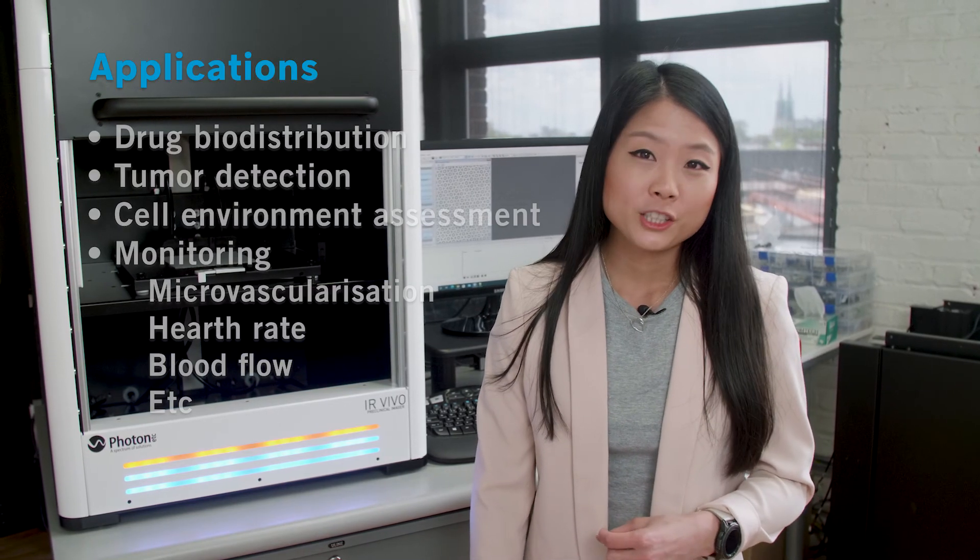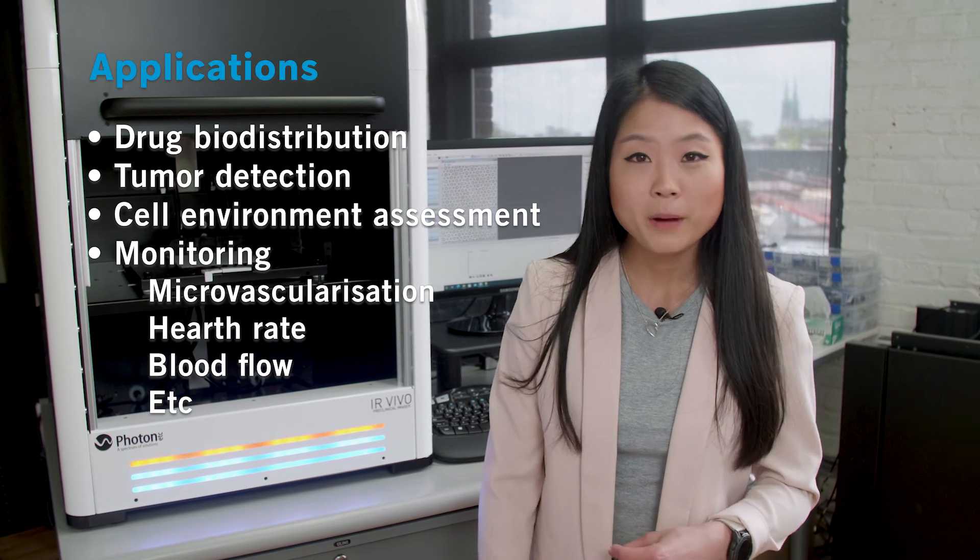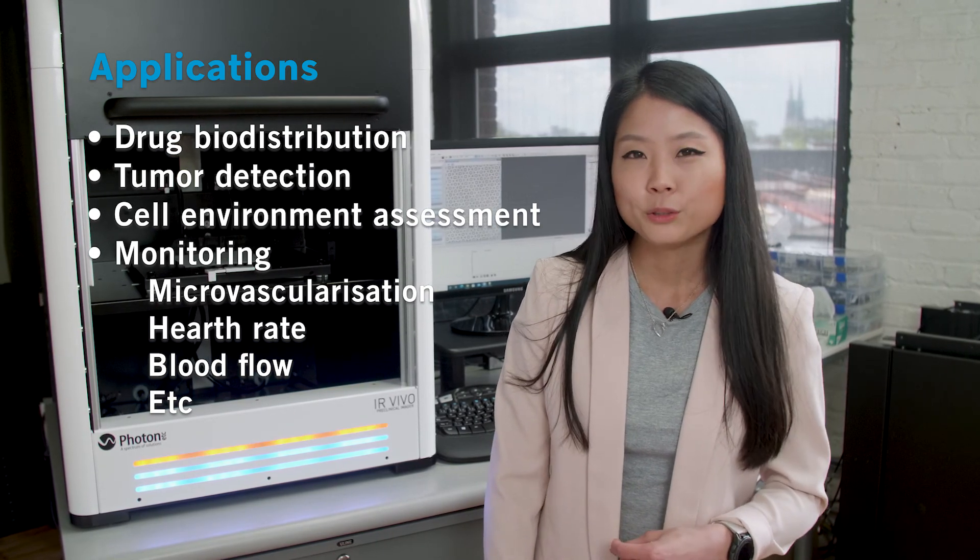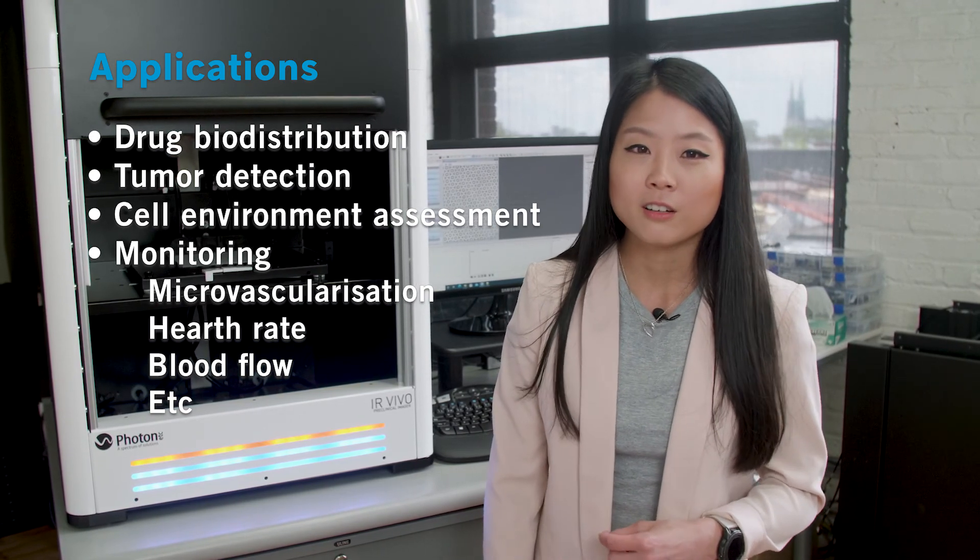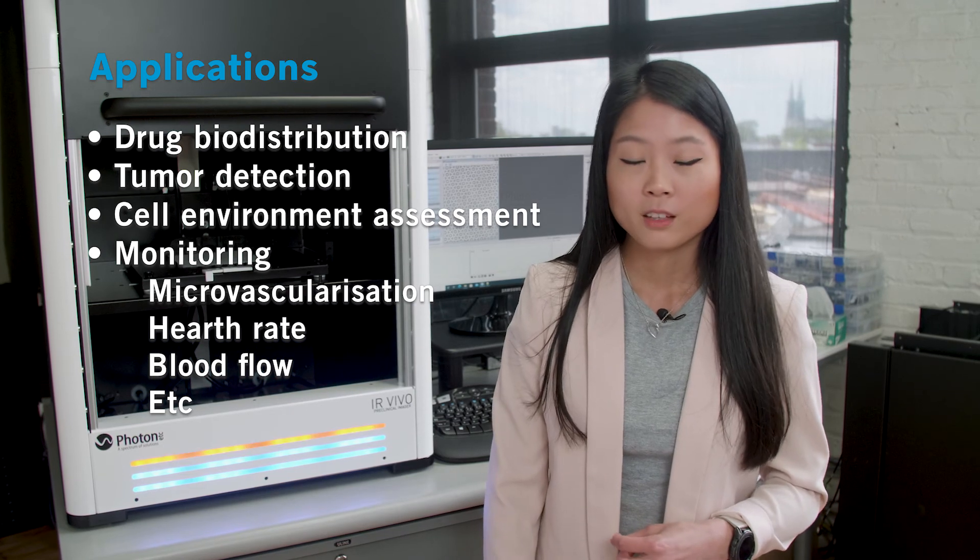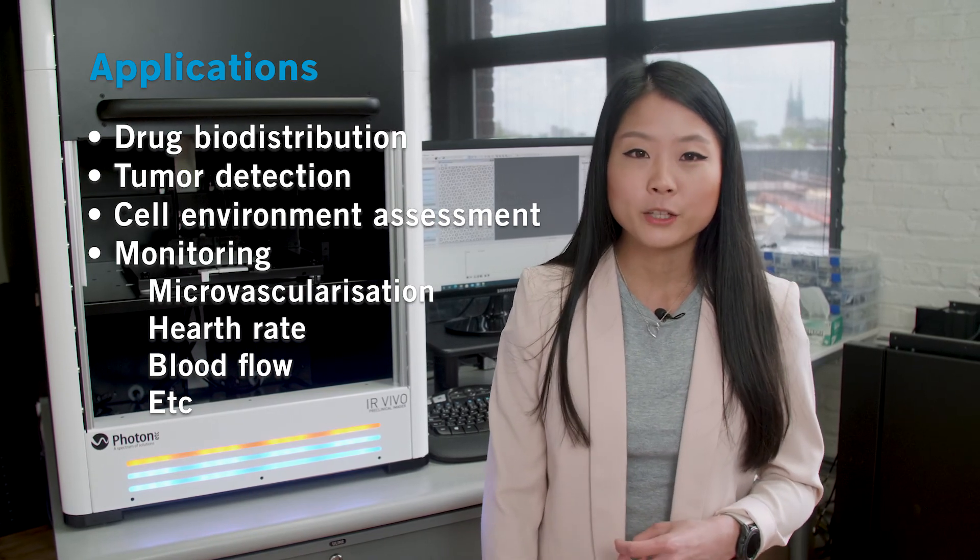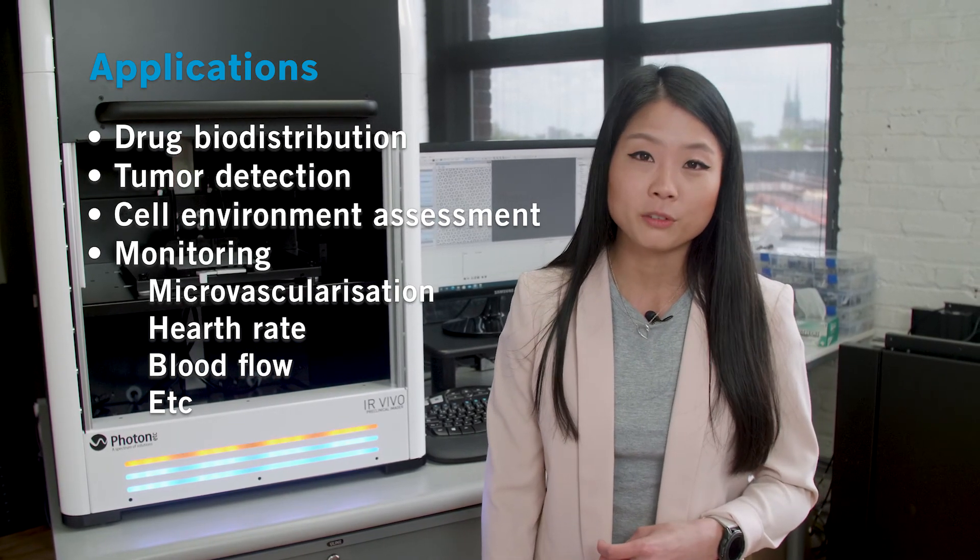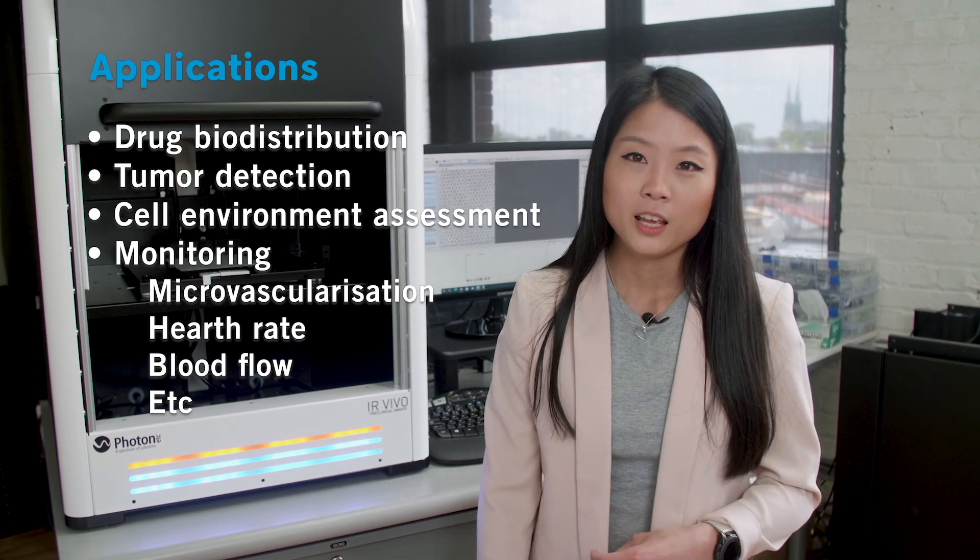Near-infrared fluorescence imaging enables new applications because we can see deeper and smaller features with a high degree of clarity. Some applications include drug biodistribution, tumor detection, or cell environment assessment, and also monitoring microvascularization, heart rate, blood flow, and many more.